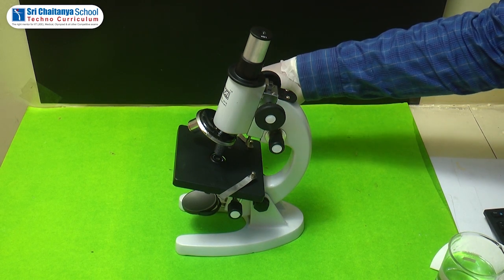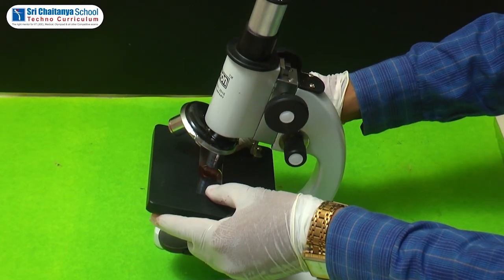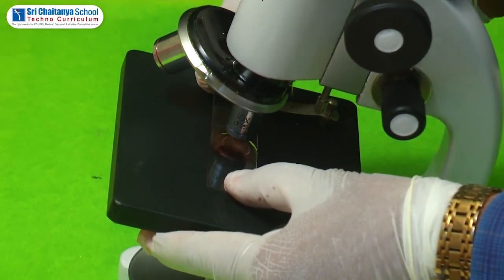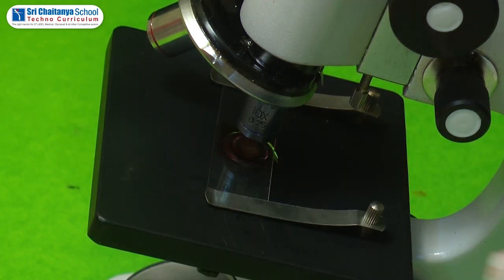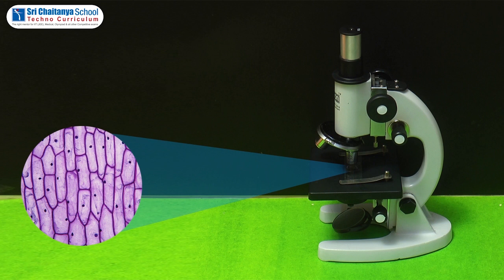Place this onion peel section under the microscope. Place the slide on the stage of the microscope and hold the slide with clips. Under the microscope, the cells are regularly packed with a definite cell wall. Below the cell wall there is a plasma membrane, a large central vacuole, and the nucleus is pushed to one side due to the presence of the large central vacuole. The cytoplasm appears very pale in color.